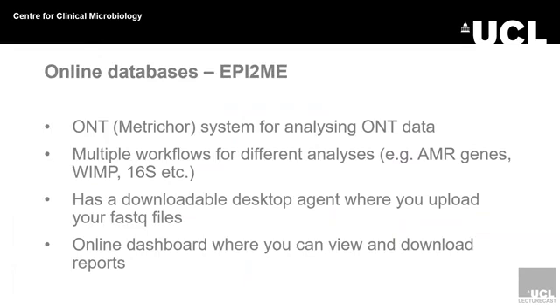So, as I mentioned, Epi2me Labs and Epi2me are slightly different. Epi2me Labs is basically a cloud-based system that shows you how to go through processing data. Epi2me is a program, or at least a cloud-based program, that kind of does it for you. So it's a database and it has certain workflows. If you wanted to do certain things, then it's quite useful for that. So for instance, it has an AMR one where it looks for AMR genes, and WIMP, which means what's in my pot. So if, again, you had a sample, say a sputum sample, and you didn't know what species was in it, you could use the WIMP workflow, or 16S. There's loads of different ones, and I can show you in a second.